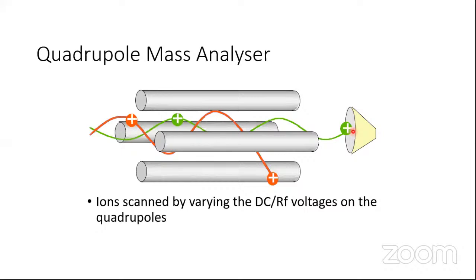If I am using this quadrupole for molecular weights up to 2000 Daltons, and the scanning speed is 20,000 Daltons per second, then in 1 second I will be able to scan 10 mass spectra. So 1 to 2000, 1 to 2000, 1 to 2000, I can do 10 times in 1 second. That means if I have a peak coming from chromatography, in 1 second on that peak I will be able to take 10 mass spectra. So it is so fast.